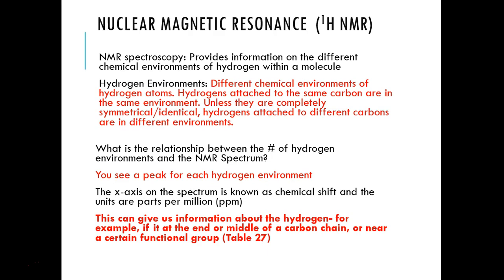Now, unless they're completely symmetrical or identical, hydrogens attached to different carbons are in different environments. Okay, so the relationship between the number of hydrogen environments and the NMR spectrum is that we will see a peak for each hydrogen environment.